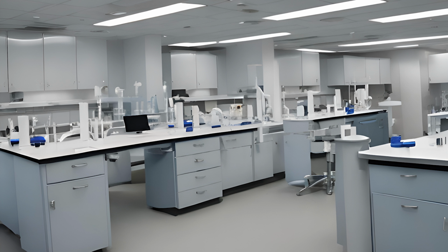Every clinical lab will have a comprehensive formal safety program that is not optional, regardless of the size of the clinical lab, even if it's just you, yourself, manning that laboratory. If you're one of one, you still have to have a formalized safety program, which will have a safety officer or a chair for your safety committee who is given the responsibility to implement and maintain the safety program.